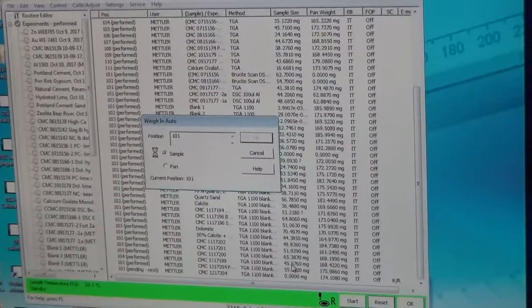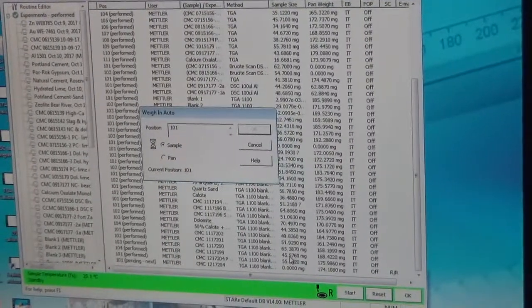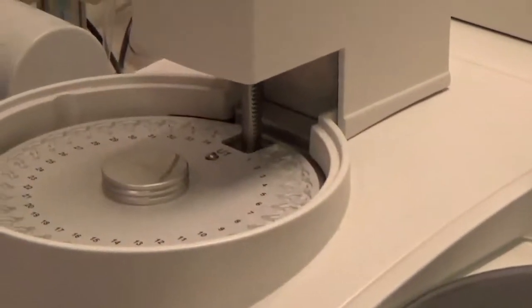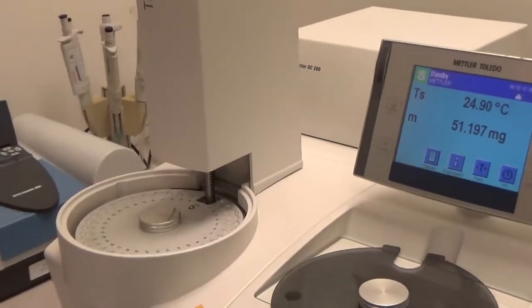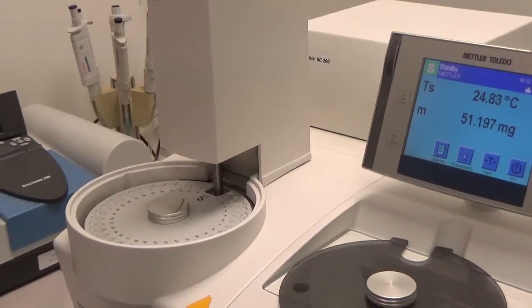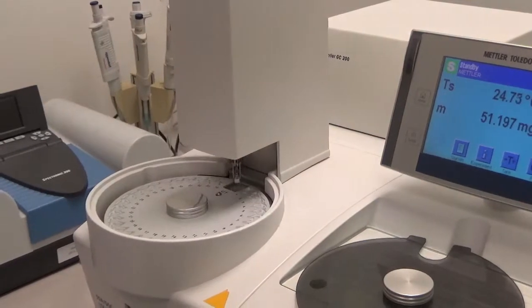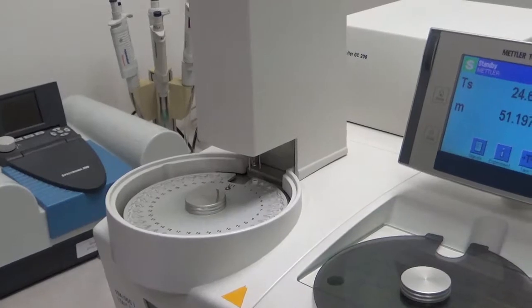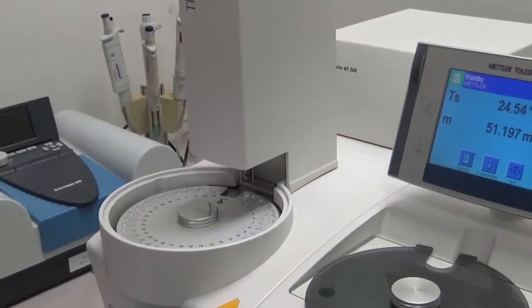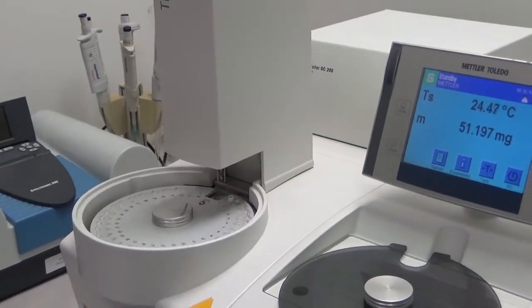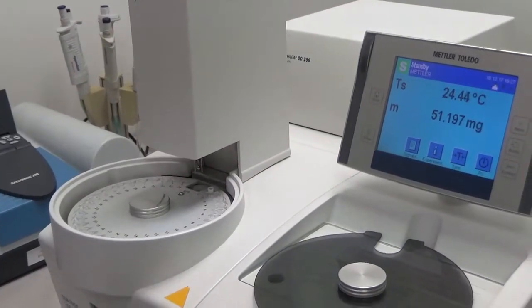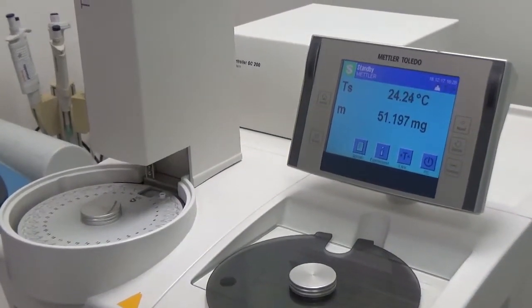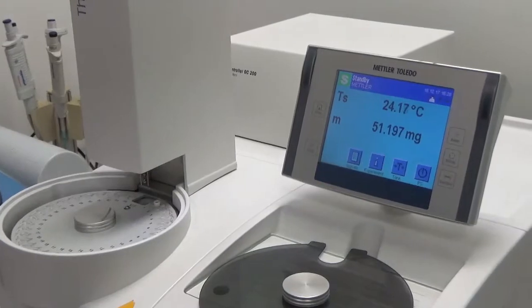Each run takes about an hour and a half, about 90 minutes, at 10 degrees Kelvin per minute, going from 30 to 1100 degrees centigrade. Once we load multiple samples, it runs overnight — we load the samples at the end of the day and in the morning when we come, the report is there. For 12 or 13 samples, it takes about a day to run.